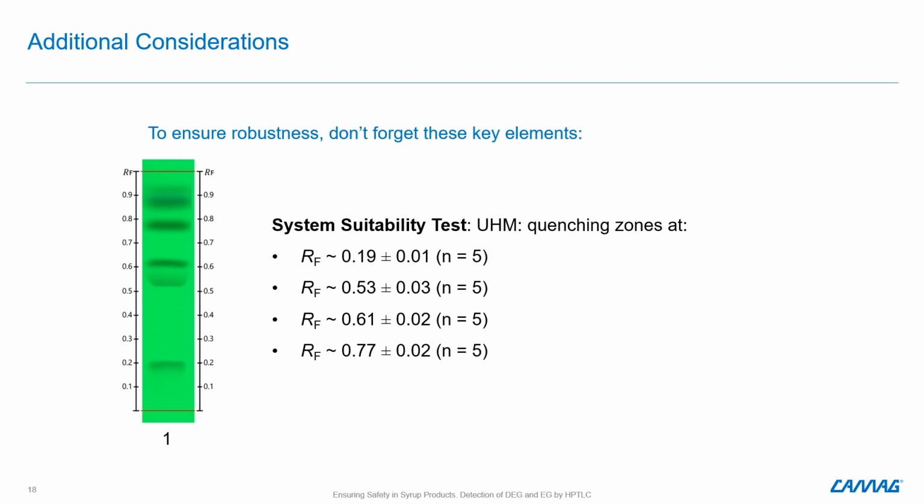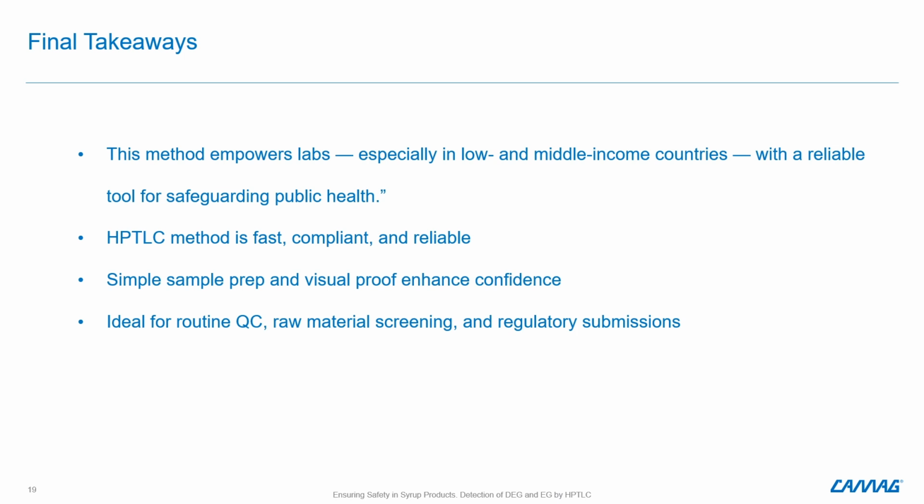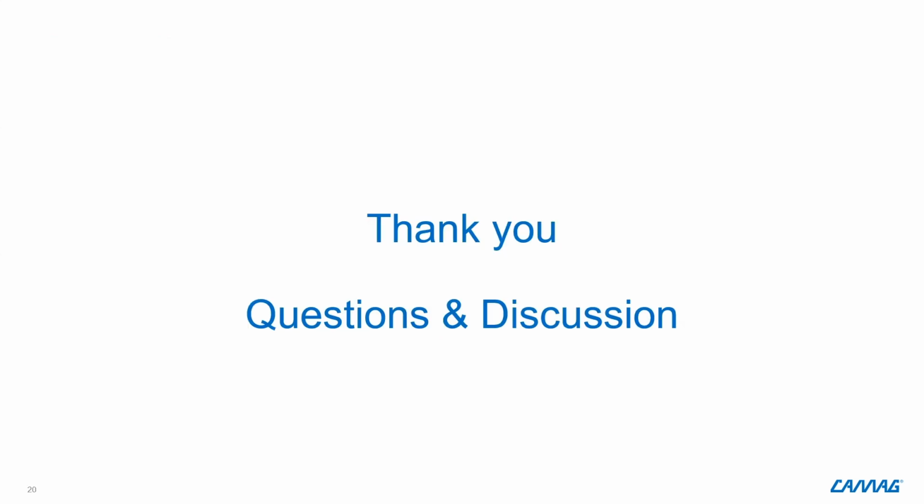This method is especially useful in low and middle income countries. It's quick, compliant, and gives visual and quantitative assurance, perfect for raw material screening, routine quality control, and regulatory submission. We hope this method empowers more labs to improve syrup product safety.